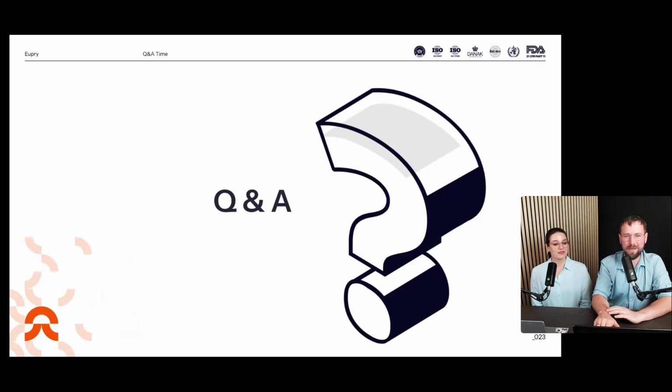So that basically concludes what we had today, and we have a bit of time for catching up on the questions. We'd love to throw a small poll out there as well, in terms of what you see as the most problematic during your mapping. Whilst we go through the questions that were collected, you're also more than welcome to write in some more. We have a question here from Masud: does two-season mapping become necessary for cold rooms and freezer rooms which are not impacted by seasonal temperature variations?